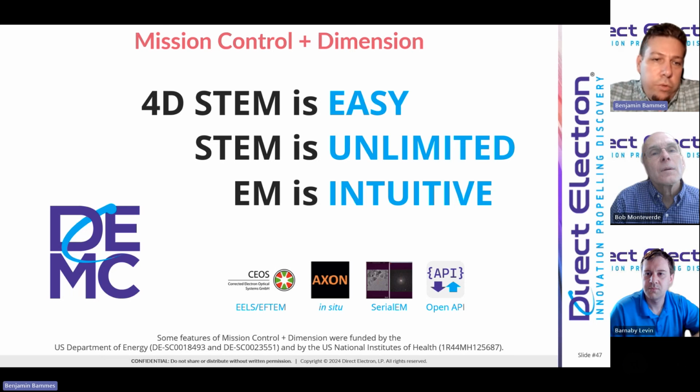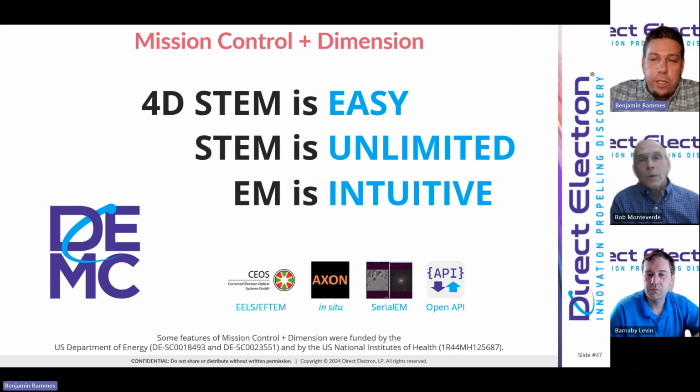Yeah, so you don't need the FreeScan to use Mission Control. We can assume that the scan pattern is just a raster scan pattern if you have a different scan generator. So you have the capability of doing virtual imaging, and there are labs using Mission Control already with their own scan generator, for instance, or a third-party scan generator.